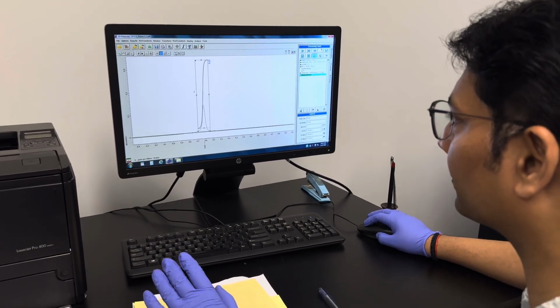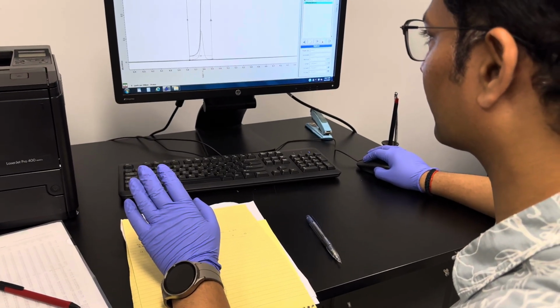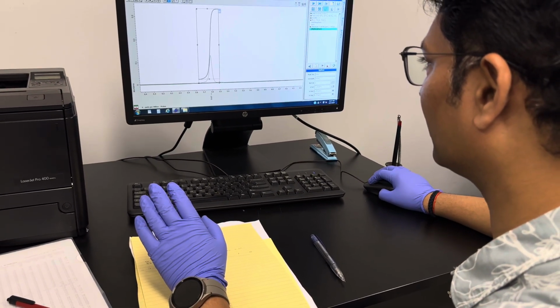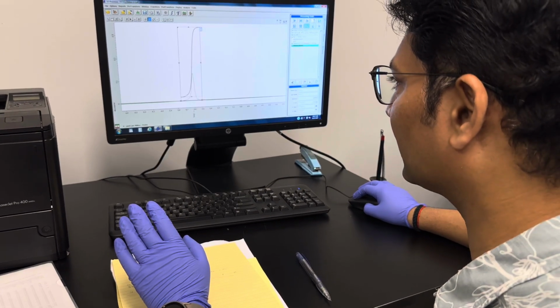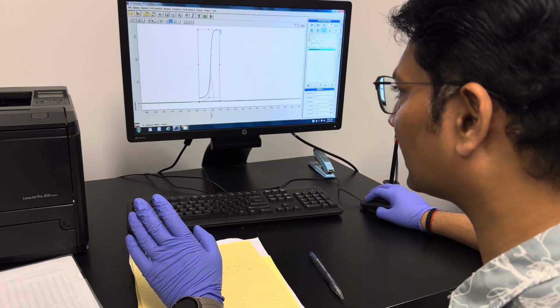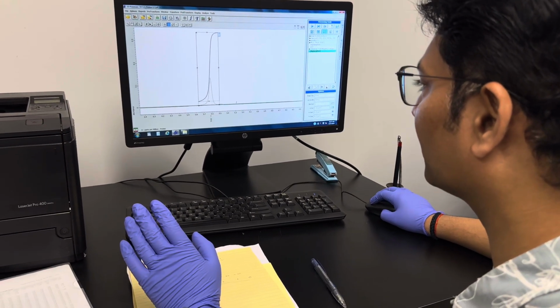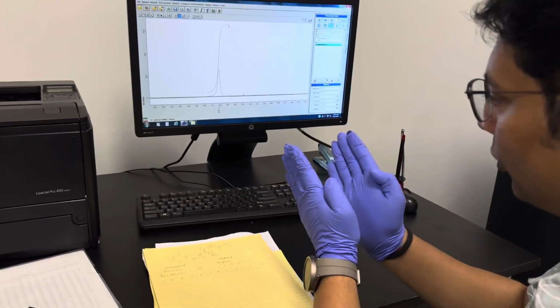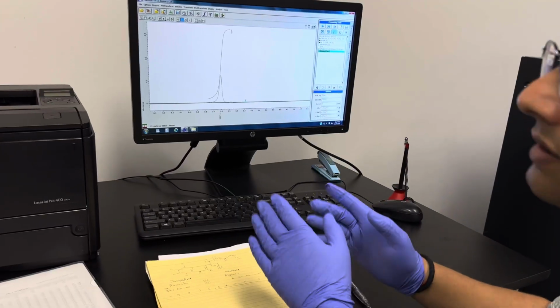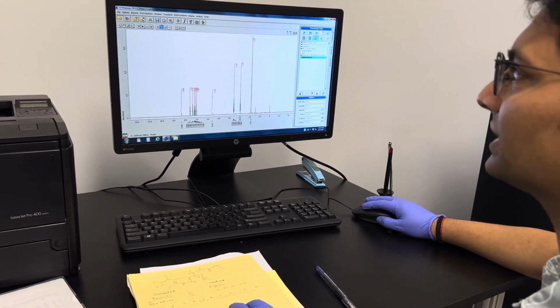We have got your product, that is important. Normally whenever we have an NH peak, it may be around 0.8, 0.9, so that is okay, because the NH gets exchanged. Because of exchange at that moment, slightly less will come, but it's okay. Now we save this.